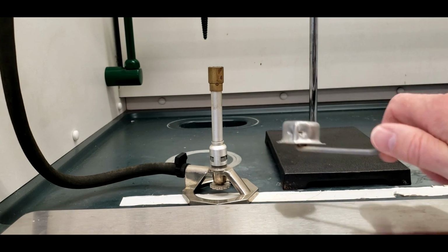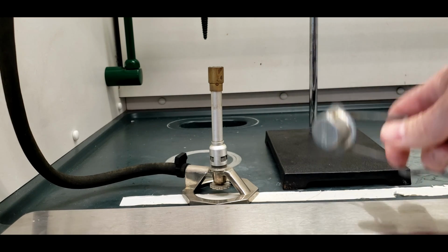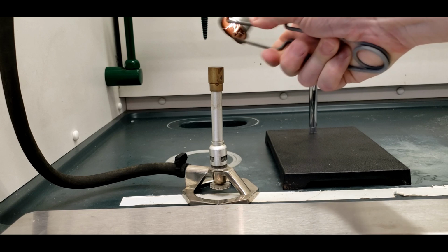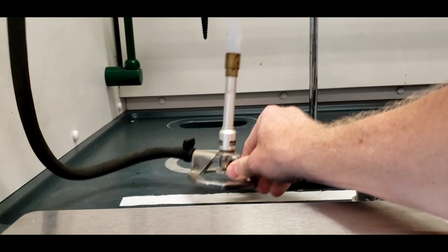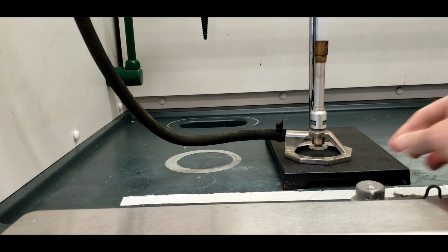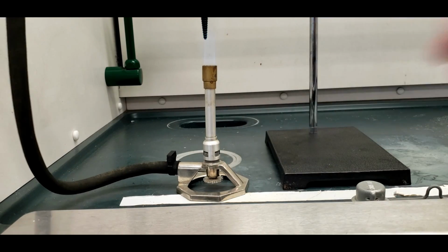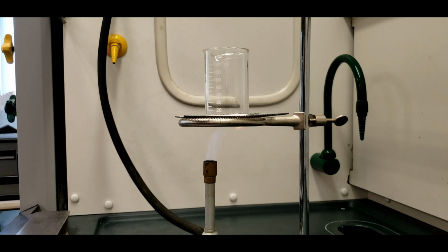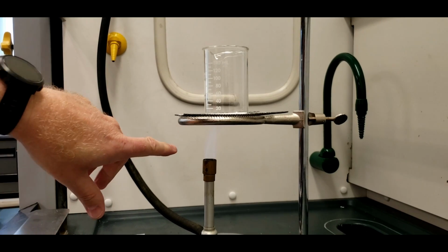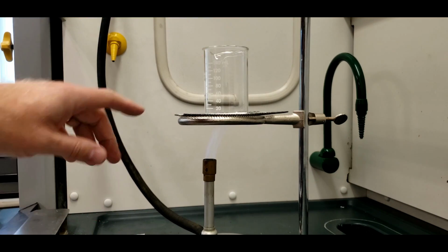So I take the striker and turn on the gas and get it going there. Yeah, I think you can see that. And we'll put it under here. And actually, we'll get the beaker on there first. Hold on. You can see the flame is on here, and it's touching the bottom. We want it to hit and just kind of spread out on the bottom.